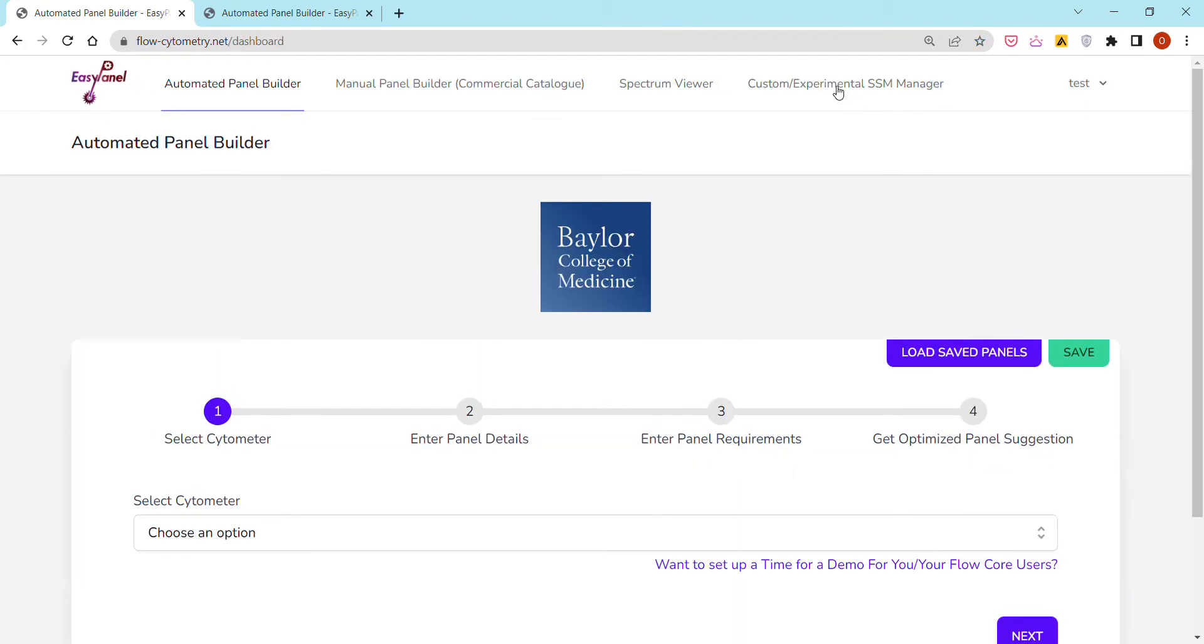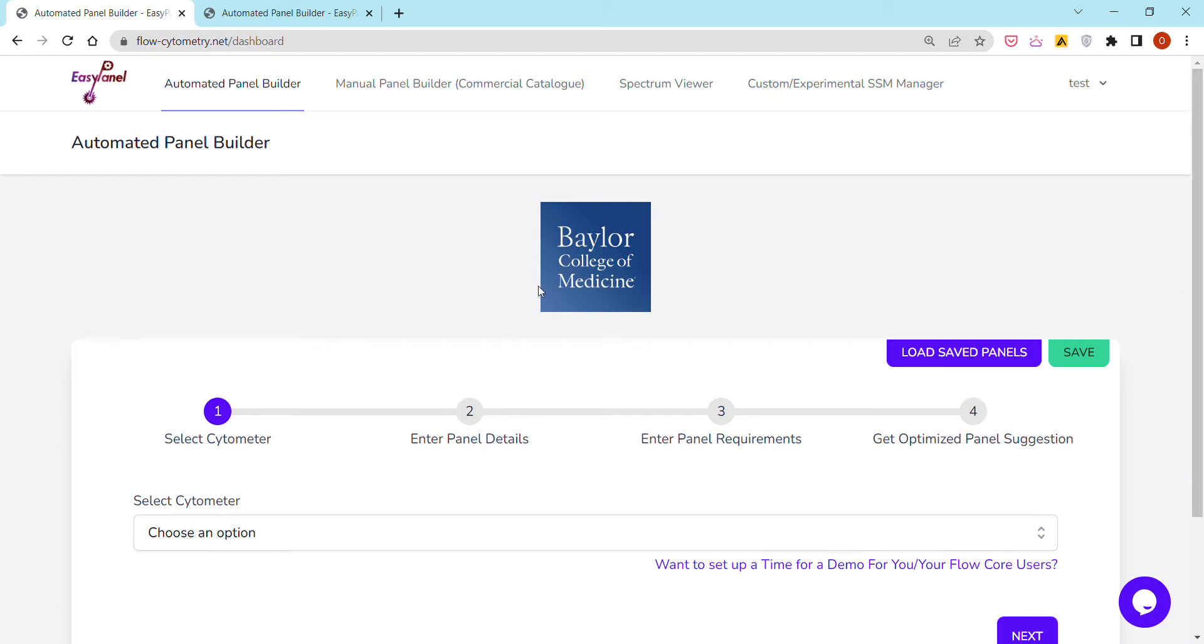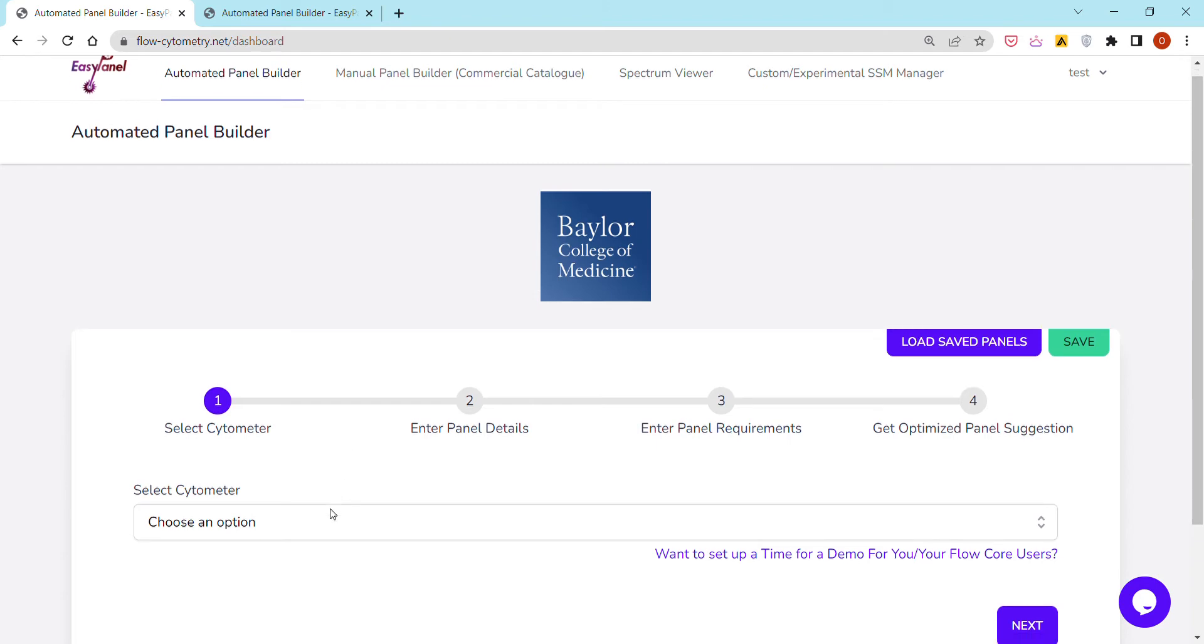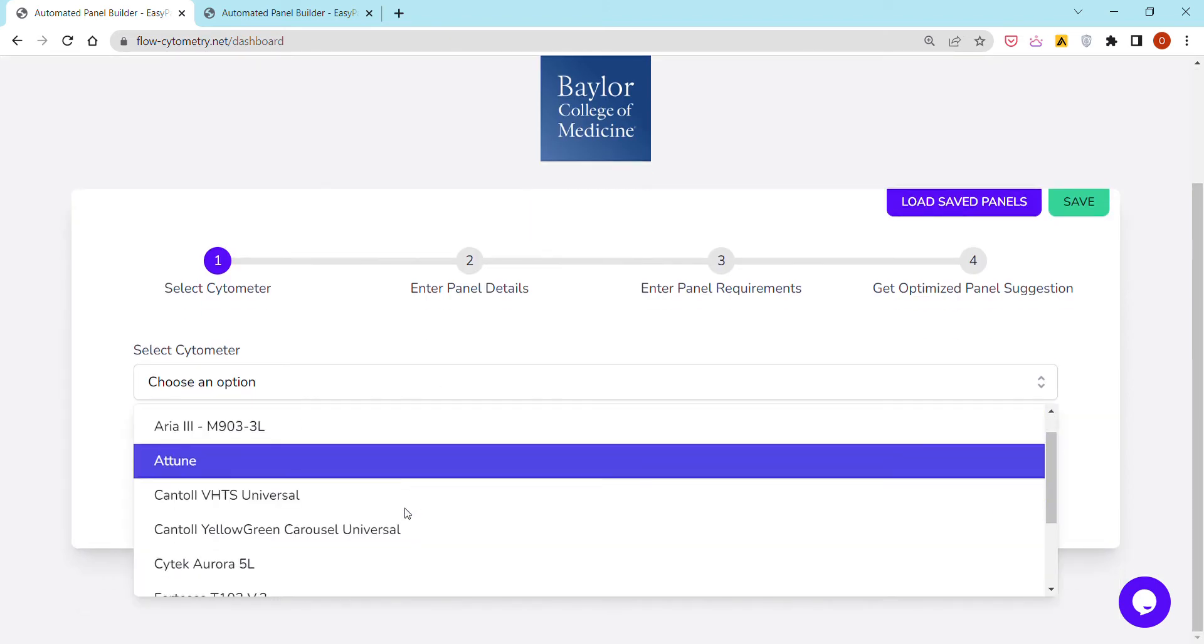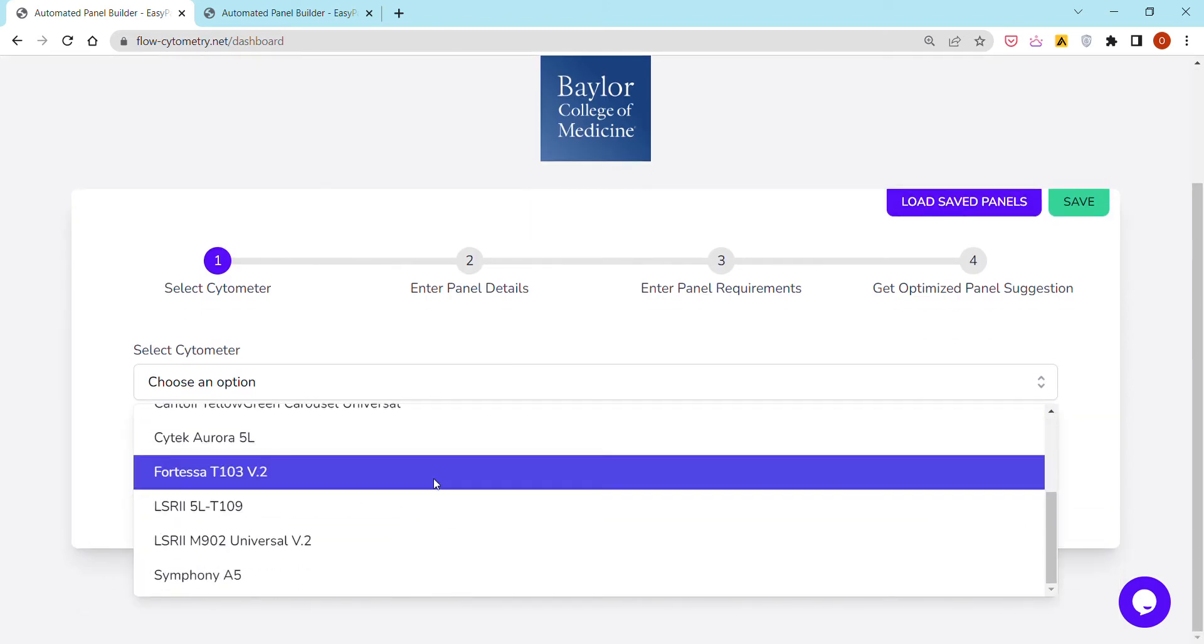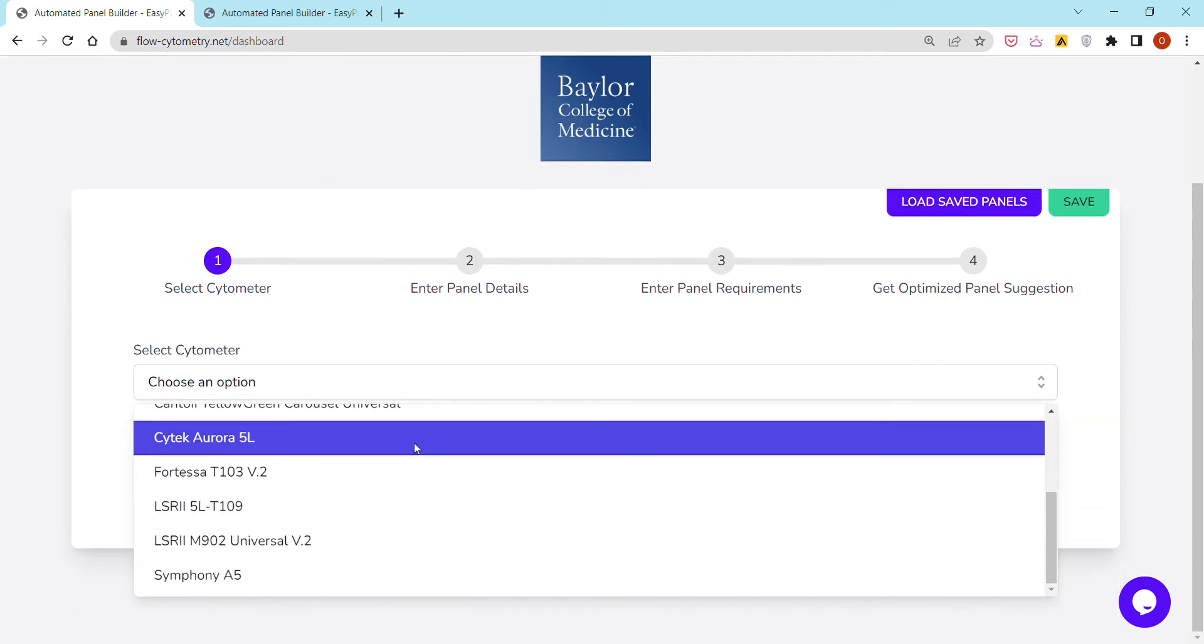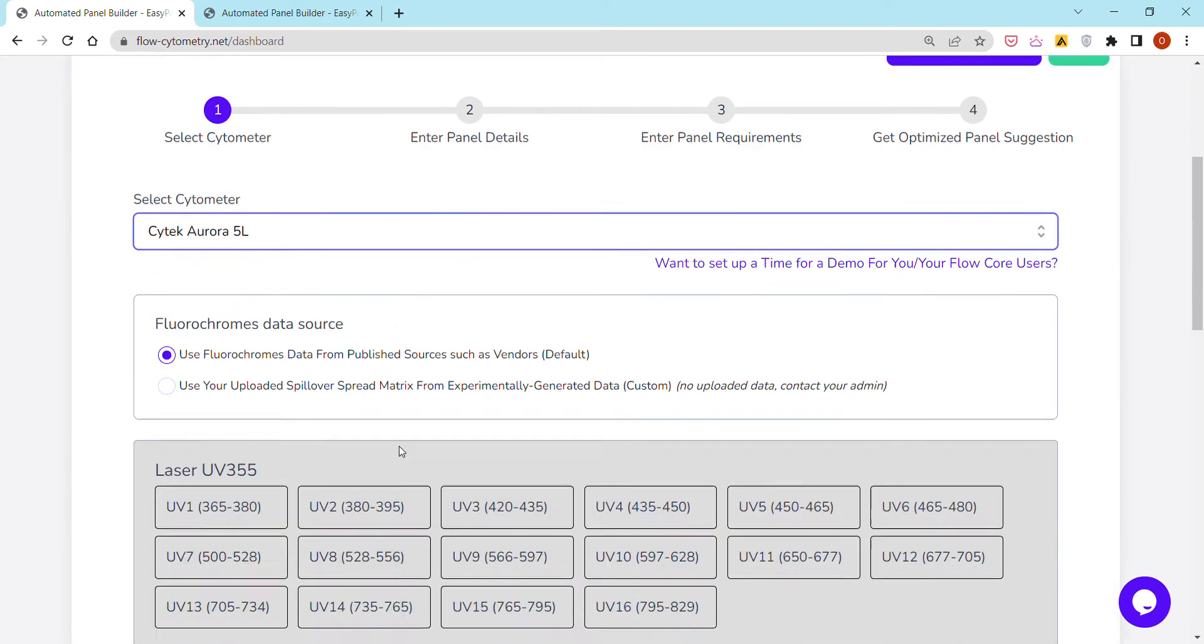People would have to go to this tab, create an account or log in if they already have one. I'm using the Baylor College of Medicine at Texas account here, and it shows me the different cytometers available at this university. I'm interested right now in the SciTek Aurora 5 laser.